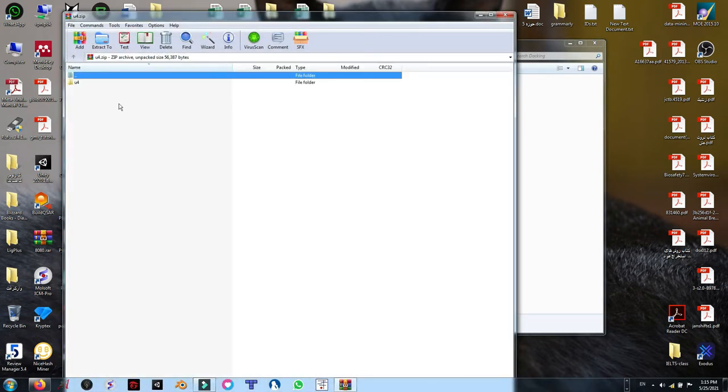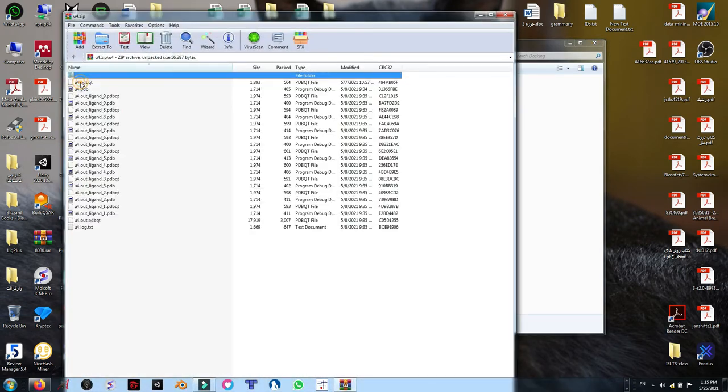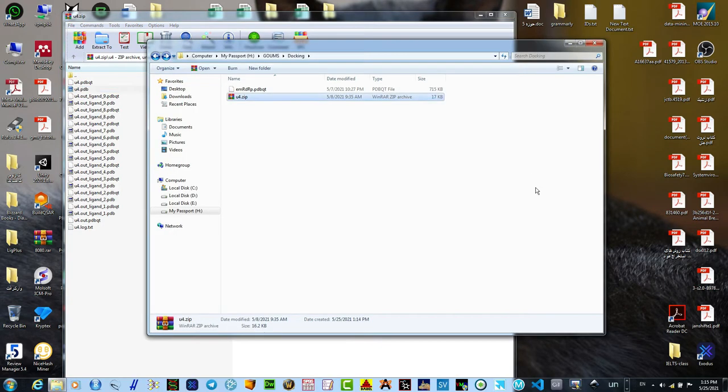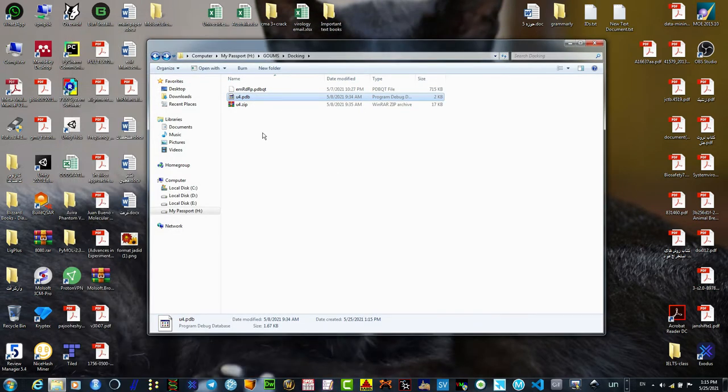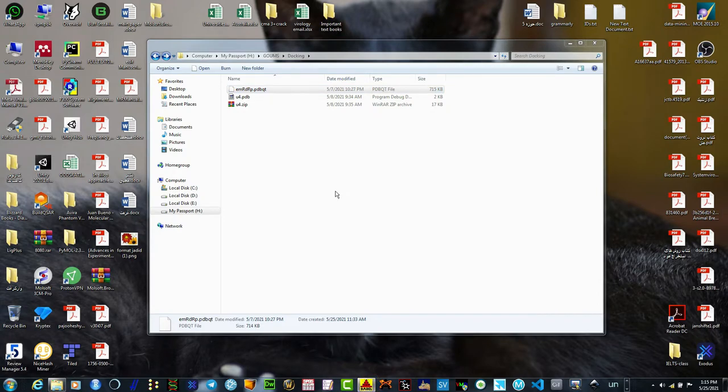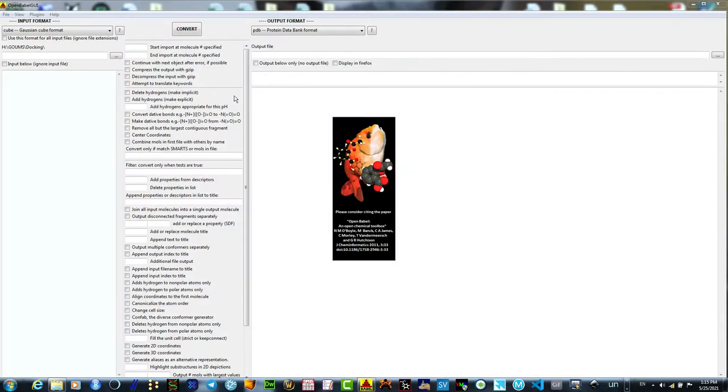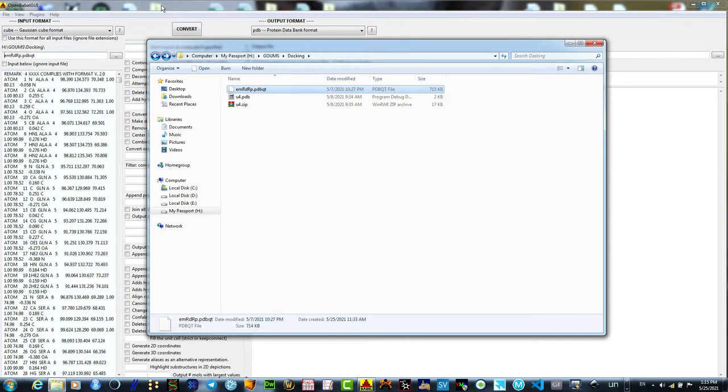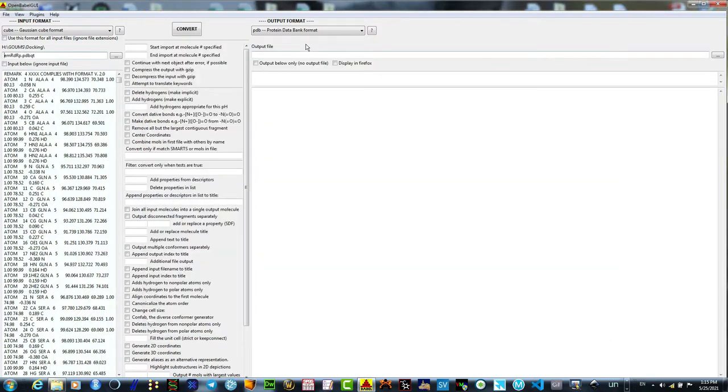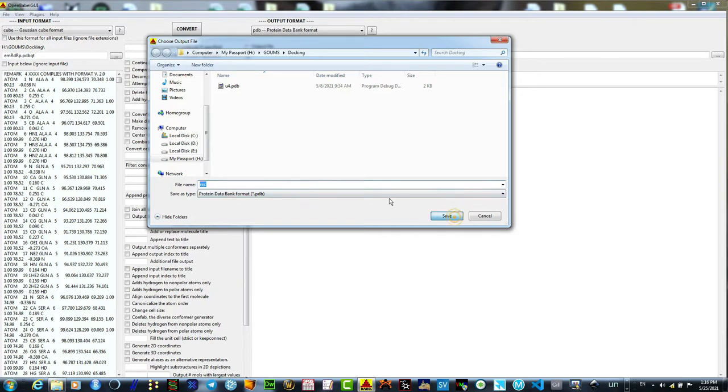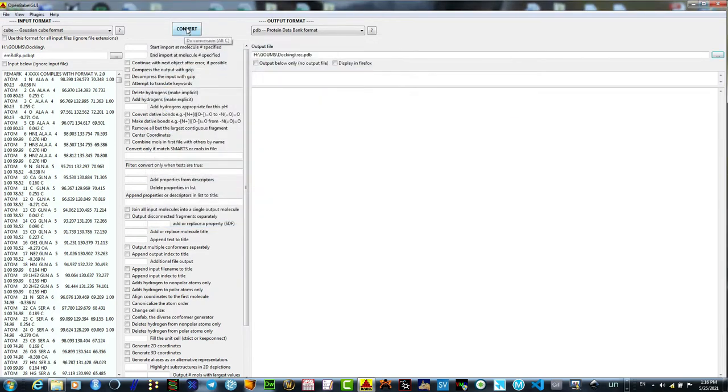I am going to take the PDB file of my ligand here. UCSF Chimera does not support PDBQT file format. Therefore, I need to convert my receptor by OpenBabel. Simply, you can drag and drop the PDBQT file here and I am going to name it receptor.pdb. I don't know, just rec for receptor.